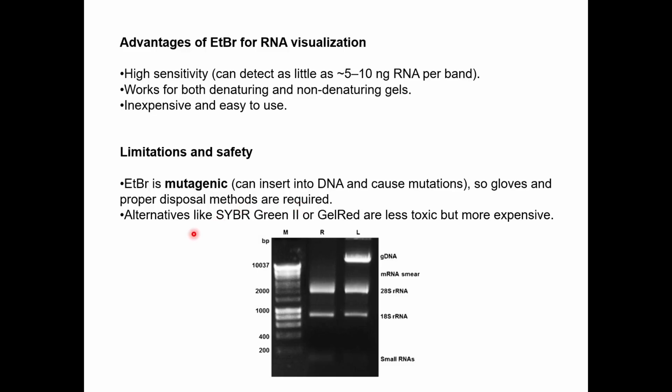You can use safer alternatives like SYBR Green 2 or GelRed, which are less toxic, but these are very expensive. So, depending upon the affordability and price, you can go ahead with your choice.